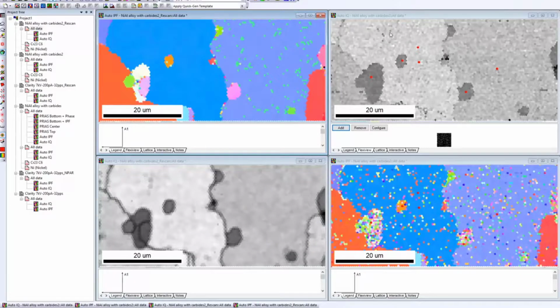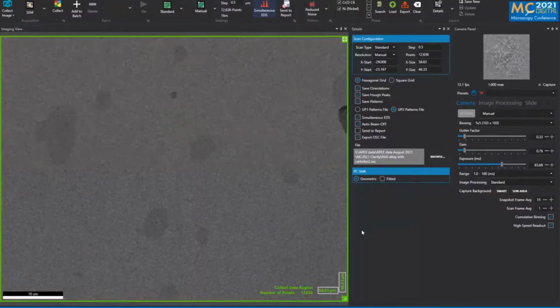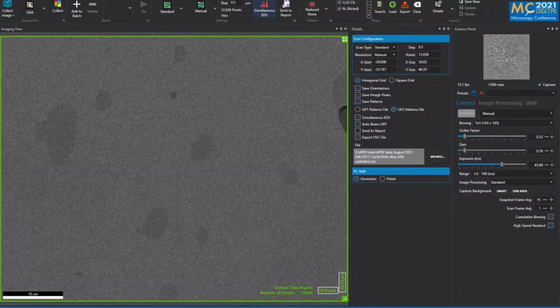Even in the image quality, it looked originally as if this was one larger carbide grain, and now you can clearly see there's 4 of them. So already there, you have a lot of information under these beam conditions. Okay. I think that's about what I wanted to show today. Are there any questions, any comments?